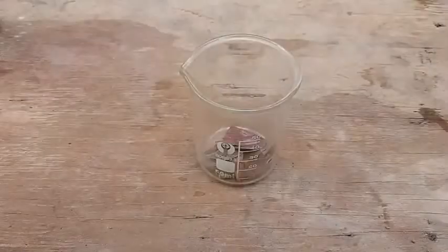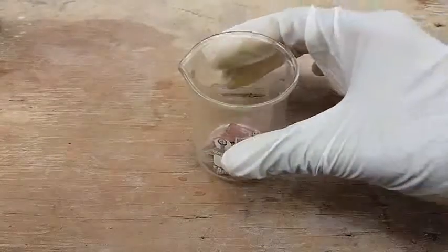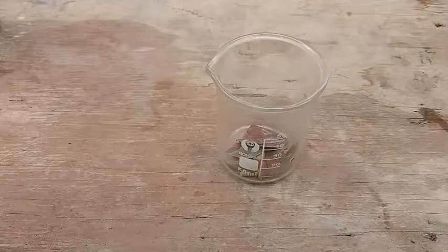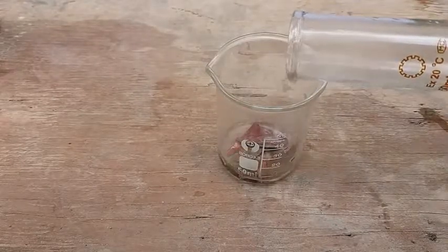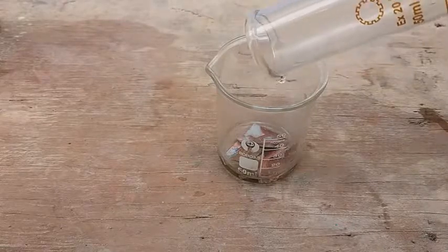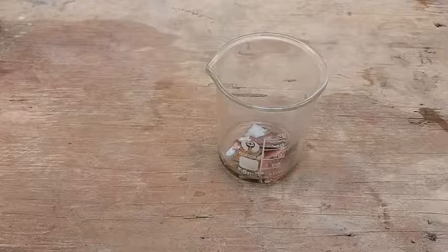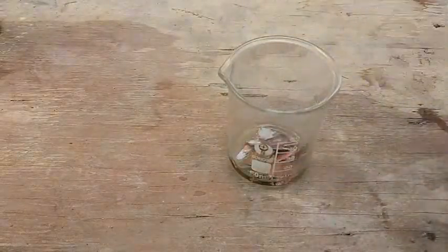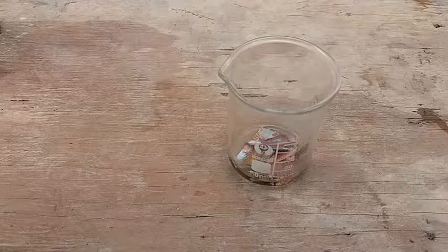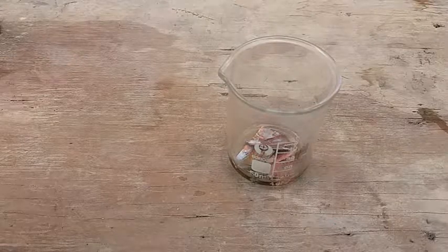The second method is reacting hydrochloric acid with copper. Now I am adding hydrochloric acid to this, and now I am adding a few drops of hydrogen peroxide.